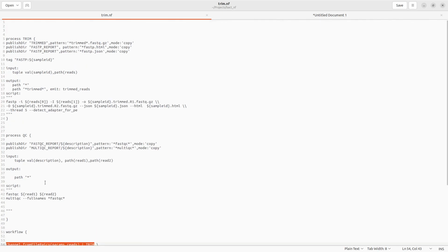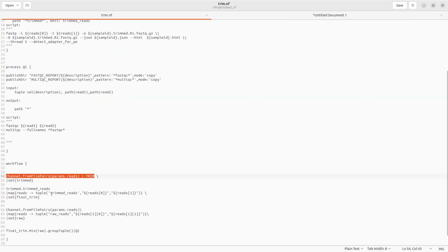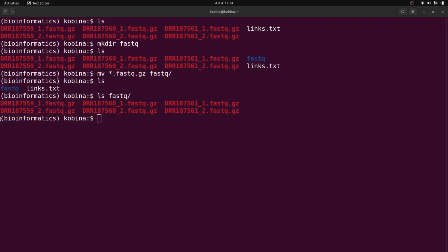We need to make sure we have our trimming command ready. It's important we do that. And also, let's do some tests first. We need to do a test before we start the exercise. So let's do this. I'm going to shift to this other screen.